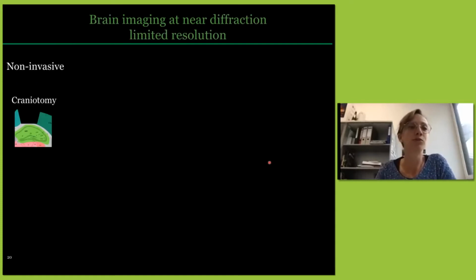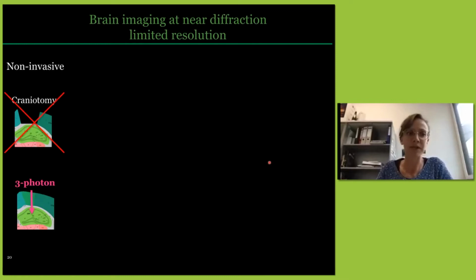So which new biological questions or structures can now be addressed with three-photon adaptive optics microscopy? Three-photon excitation allows us to investigate subcortical brain regions such as the hippocampus non-invasively, which previously required invasive procedures such as the removal of overlying brain tissue in combination with two-photon microscopy.